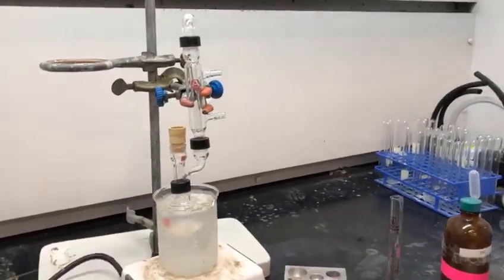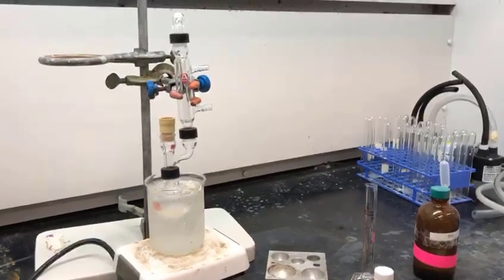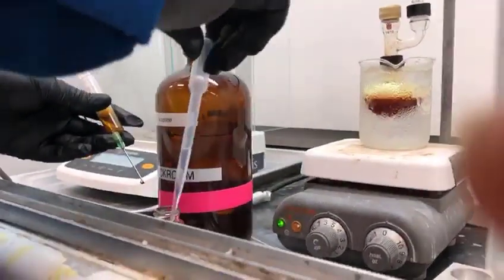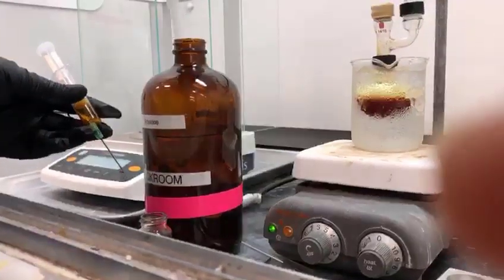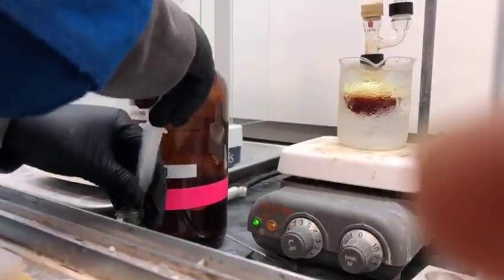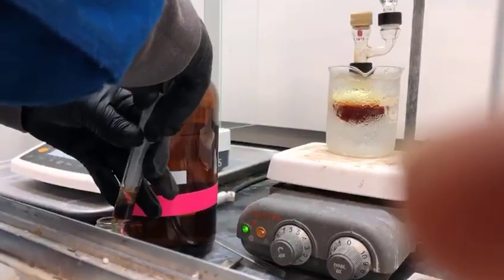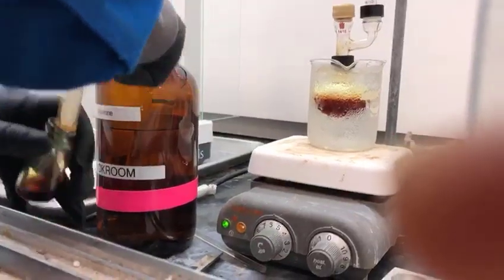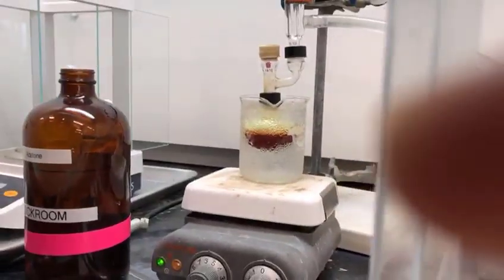Currently we are at the point where all of our I2 has been added to our 10 millimolar 1-hexene that was mixed with 10 milliliters of THF. As the procedure states in step number eight, the syringe is being rinsed with acetone.